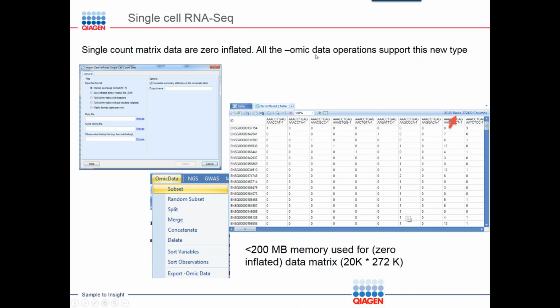So that's about it for single cell RNA-Seq. As you can see, we're focusing on two things. First, we're focusing on helping users generate this matrix from FASTQ files, which we think is a necessary step of data reduction. So no matter if you have 10x Genomics data or something else, we have modules for you to pre-process, filter, align, but also count.